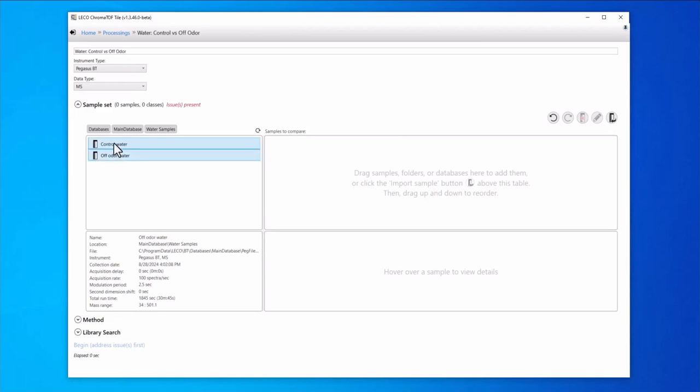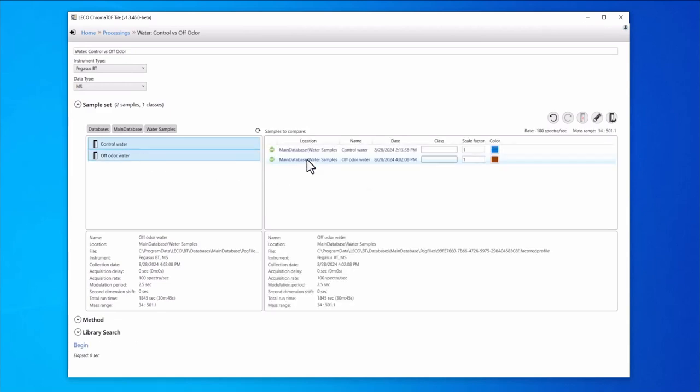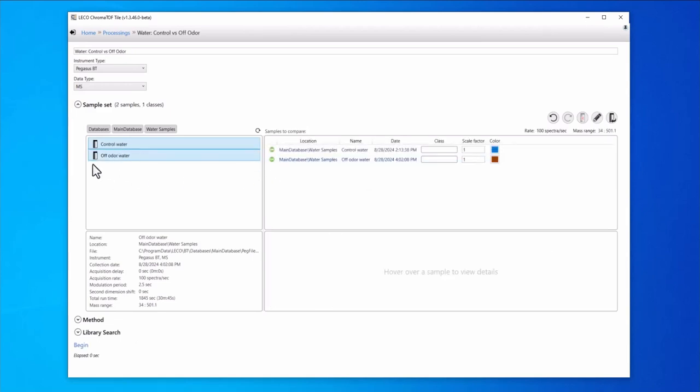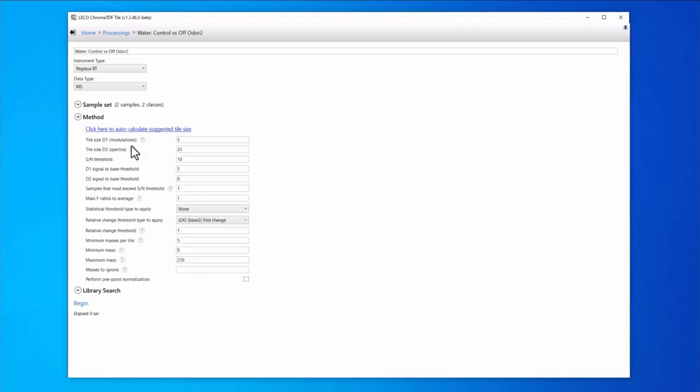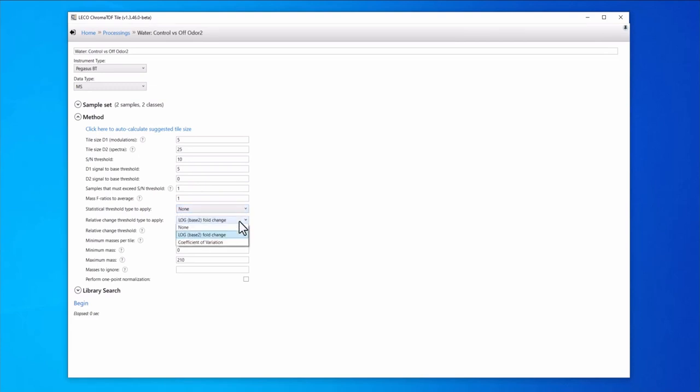With the Fold Change test, we have the option to compare just two samples, and defining sample classes is optional. We can select this option from the drop-down menus in the method. These comparison options help provide more flexibility and cover more experimental designs and comparison objectives.